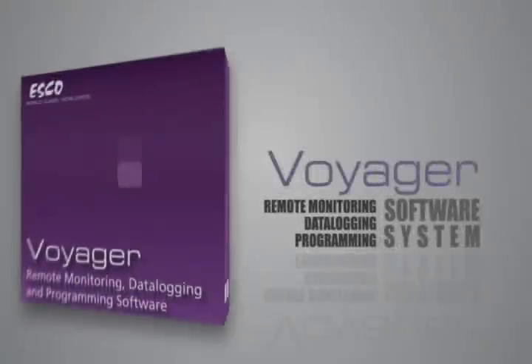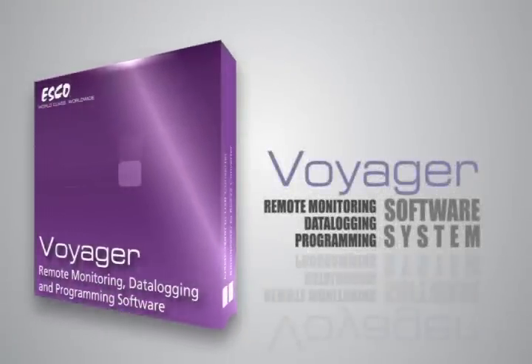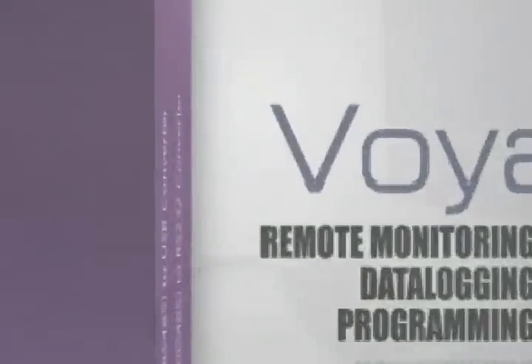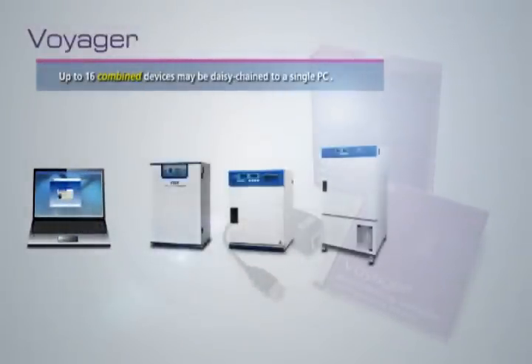The ESCO ULT Freezer is compatible with ESCO Voyager PC-based software system, developed for the remote monitoring, data logging, and programming device configuration of ESCO controlled environment laboratory equipment. Up to 16 devices may be interfaced to a single PC.